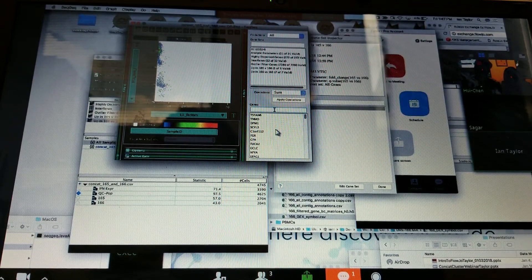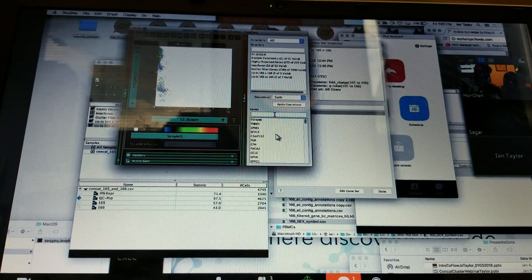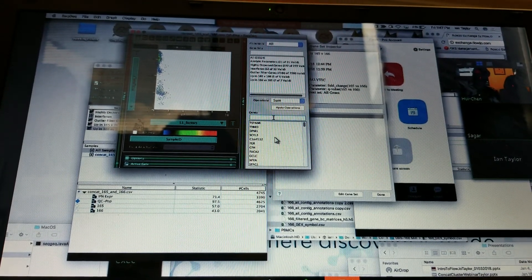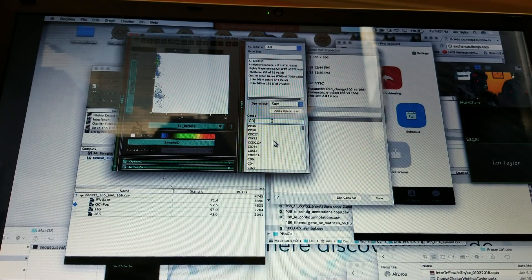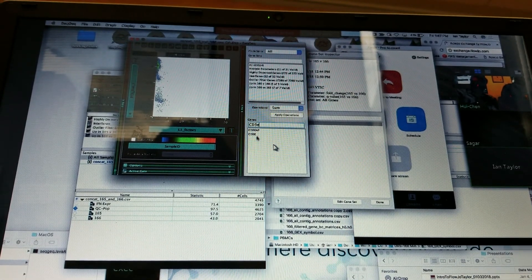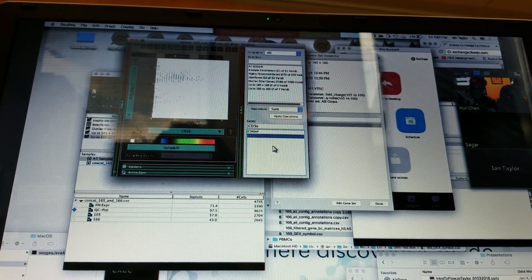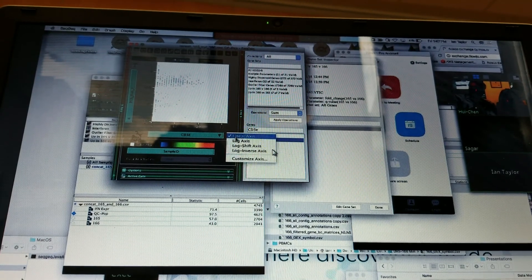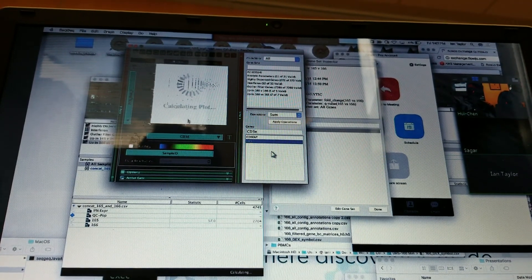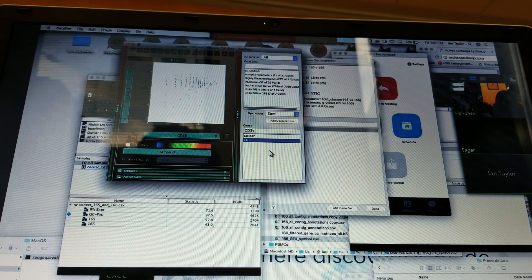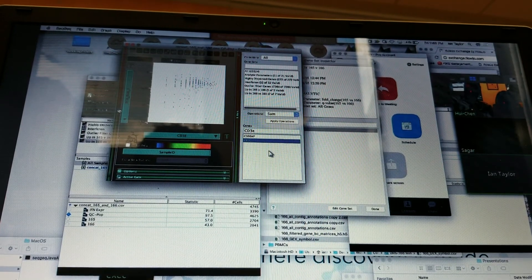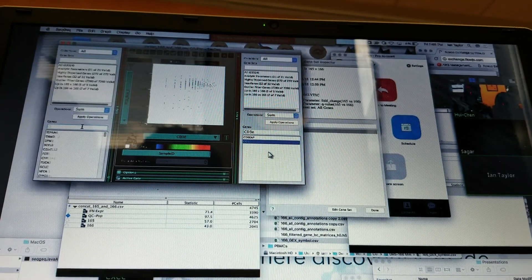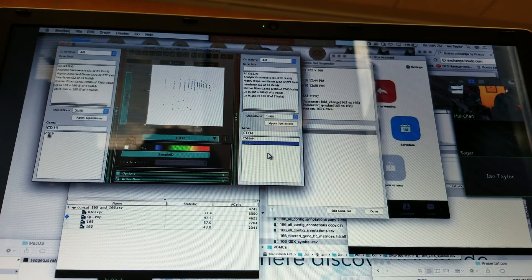One really common one would be like CD3E, the epsilon chain, and CD3 surface properties. Right, and these should be able to tell us roughly where we expect to find T-cells. So something like a log axis probably, and then if we were curious about these cells, probably CD19 would be the one I would use.